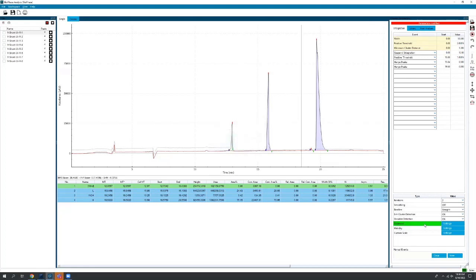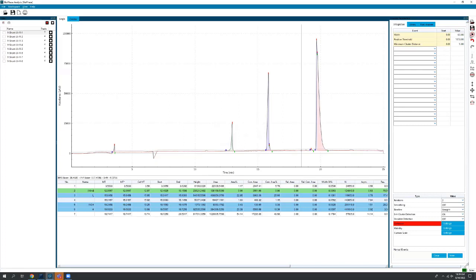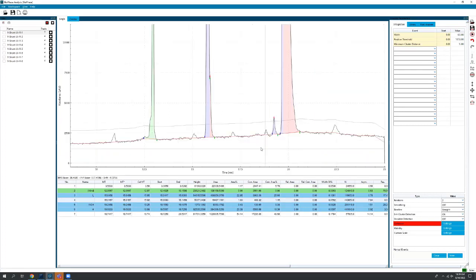So we click that, and we can see this turns green. And then up here on the upper right-hand side, we see parameters modified. Click this play button. For those of us who might remember a Sony Walkman or something like that, click that play button, and then it'll go ahead and analyze it based on those parameters.